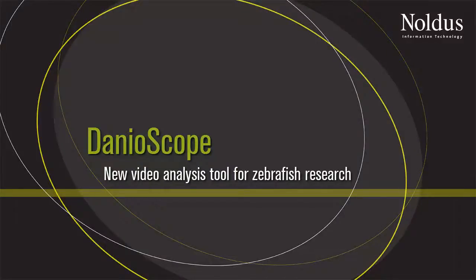Noldus Information Technology presents a new tool for zebrafish research: DanioScope.